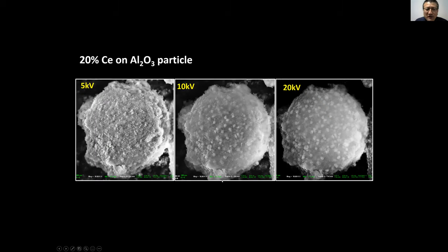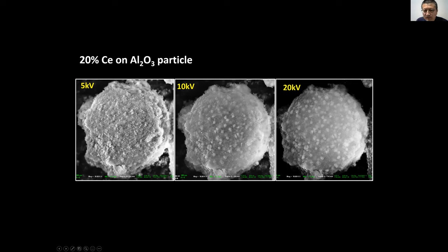I don't want to give the wrong impression that high voltage is useless. Here's a sample containing 20% cerium — cerium is heavier than aluminum. At 5kV you cannot see where the cerium is. But when you increase to 10kV and 20kV, you start to see the little particles appear. Most likely, these particles are embedded below the surface. Low voltage cannot reach them; high voltage penetrates deeper, revealing the subsurface particles. It really depends on what you need.